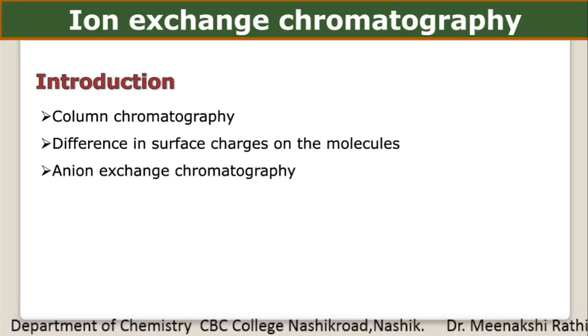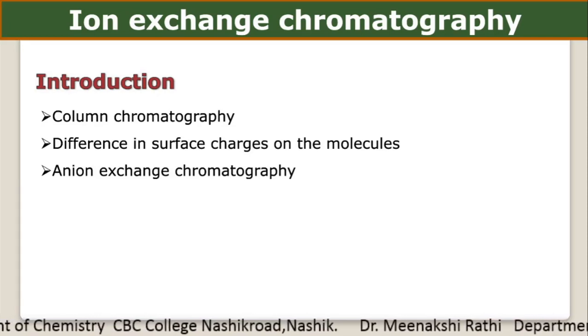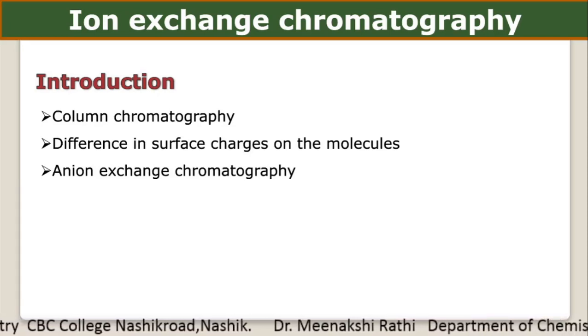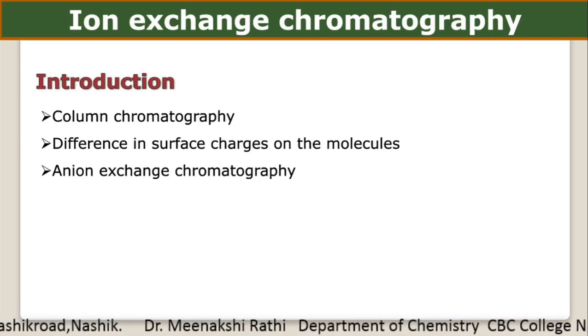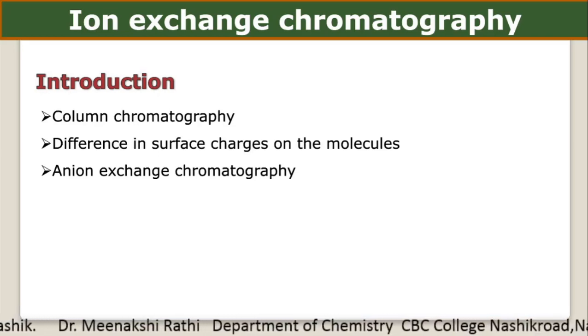There are two types of ion exchange chromatography. The first is anion exchange chromatography, in which negative ions are exchanged between the ion exchanger and the mixture.